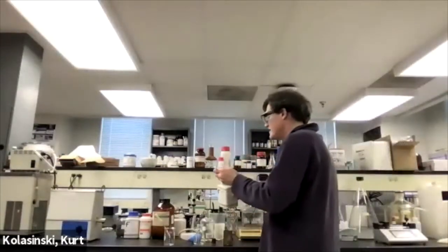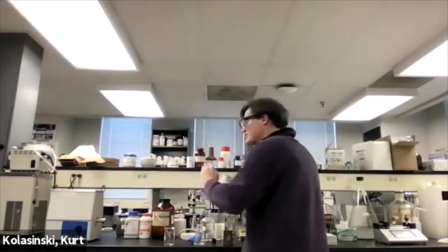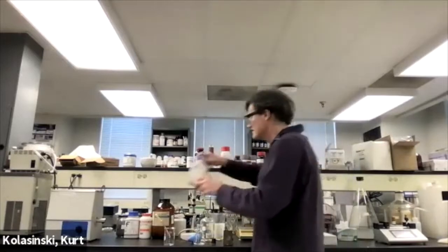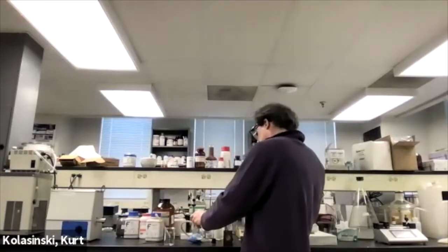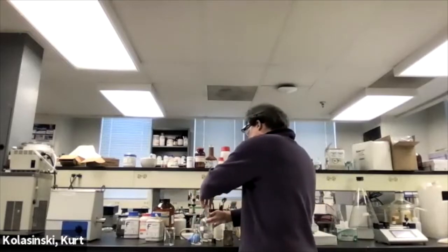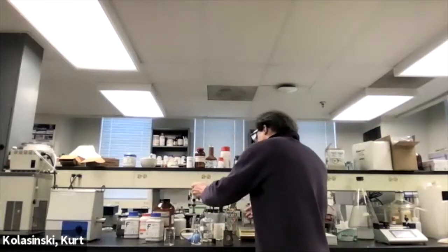A spoonful, not even a spoonful, just a spatula full, right? Because there's always that 1,000 times volume expansion from a solid to a gas, right? So we don't need a whole lot of that. So we'll stick that over on the side. And then we just need a couple of drops, 3-4 drops of sulfuric acid, no more than that.